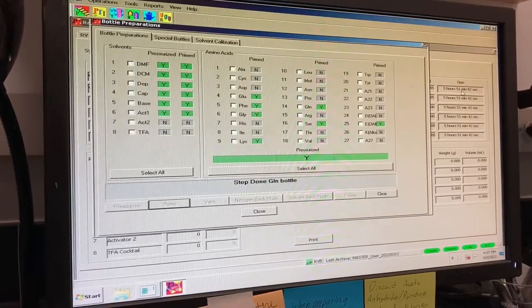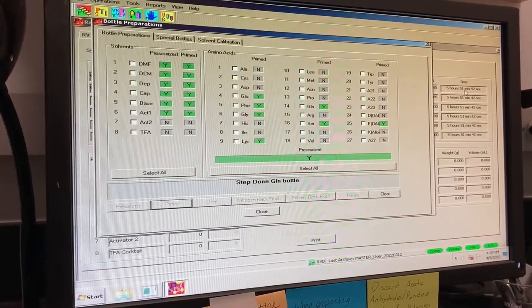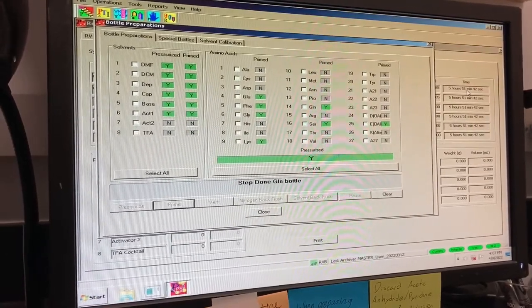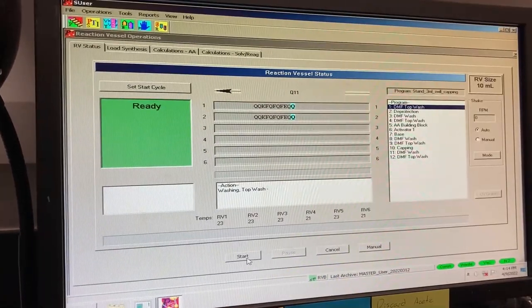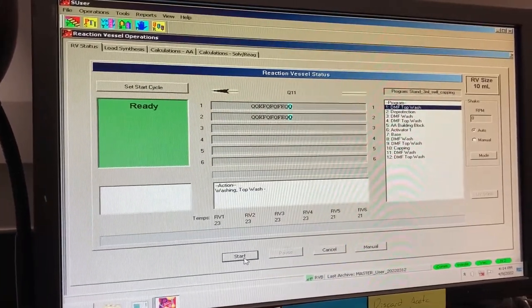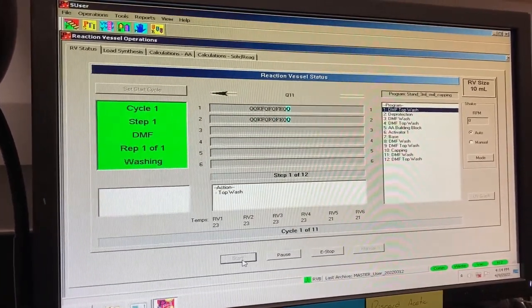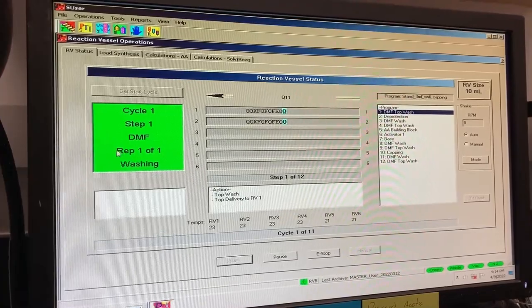Once all the bottles are pressurized and primed, return to the RV status page and click start. If there are no errors, the window on the left will change from ready to cycle one.